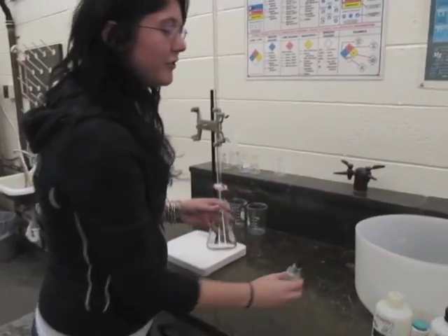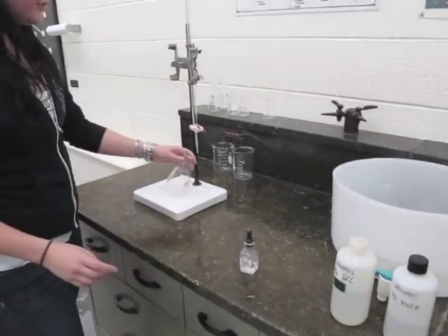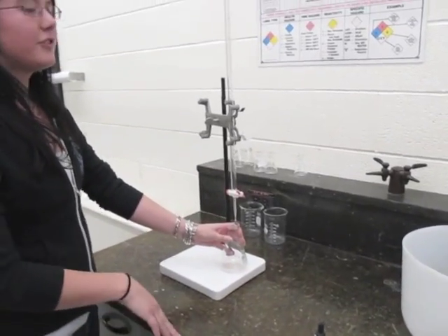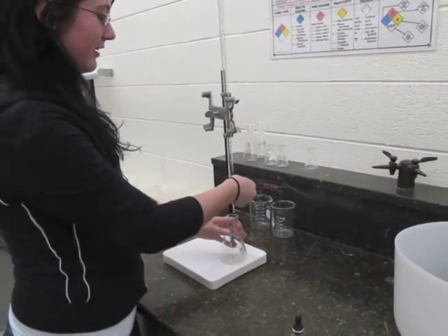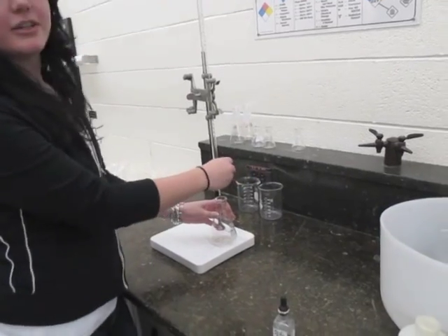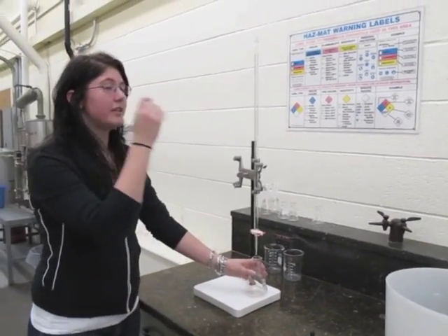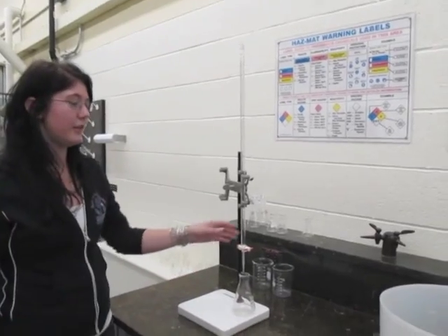You're going to add two drops of phenolphthalein to your solution, bring it over to your burette that's filled with sodium hydroxide. You titrate drop-wise with sodium hydroxide until the solution turns pink, and make sure you record the initial and final volumes in the burette.